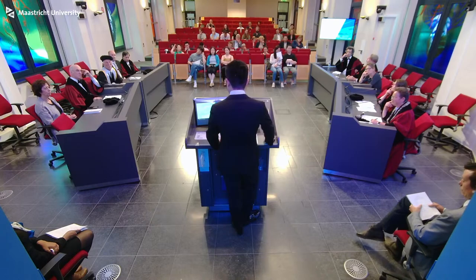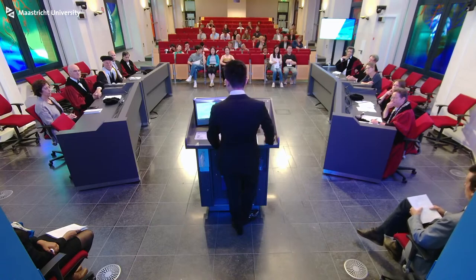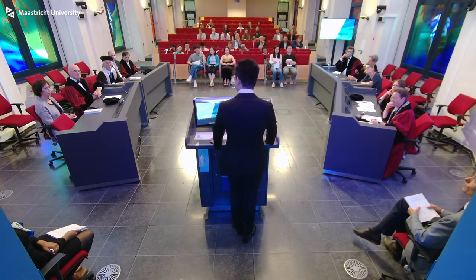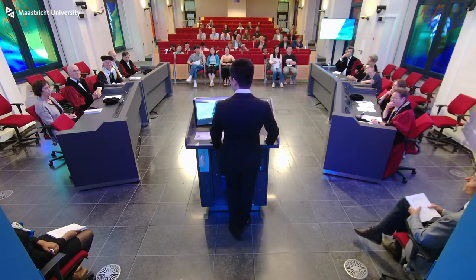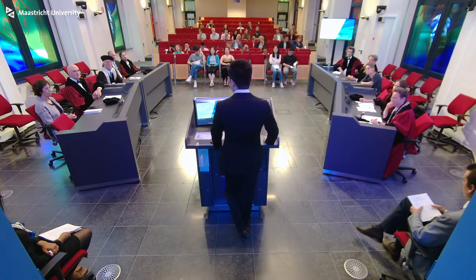But they use an Eiger detector. I suddenly forget the name of the company, but it's the Eiger detector, and it is actually not, in my opinion, as good as Timepix. And with the Timepix, or even Timepix for the next generation, we would anticipate that we could reach 2 angstrom or even below 2 angstrom.